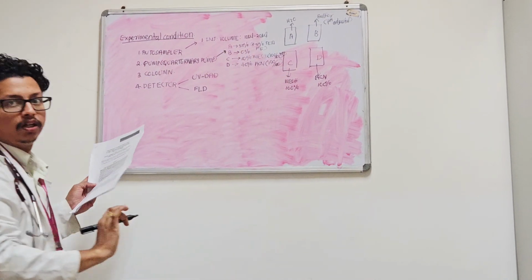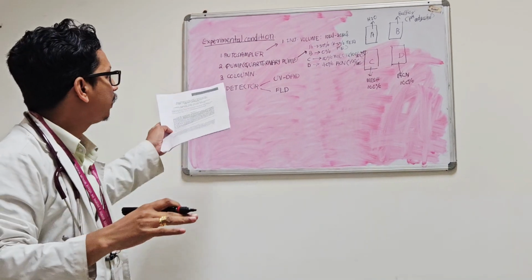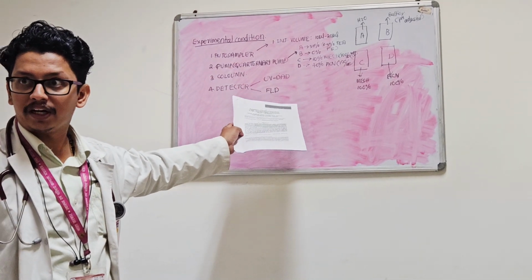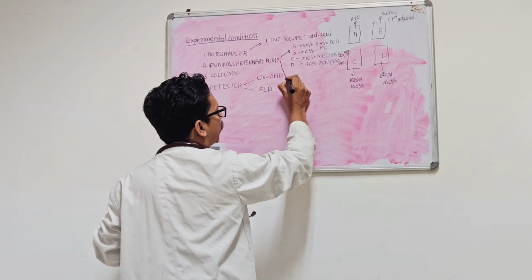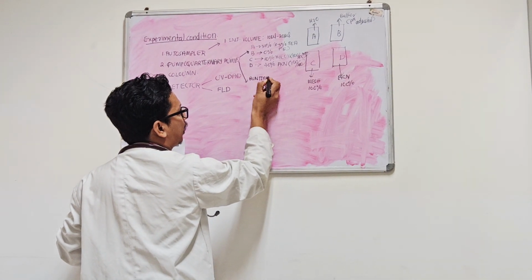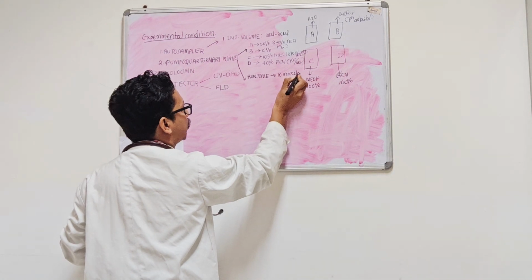It's clear now. So this is solvent gradient, as opposed to isocratic flow. I have set the solvent gradient. After that there is the run time. I will select 10 minutes. Run time I set as 10 minutes.